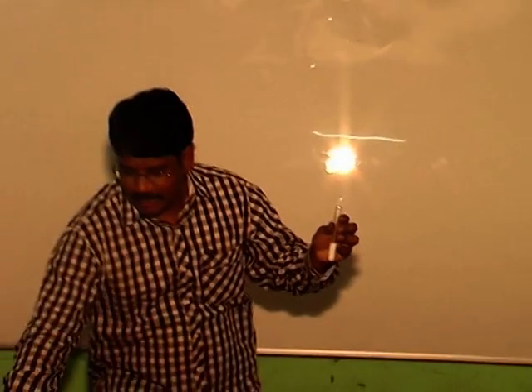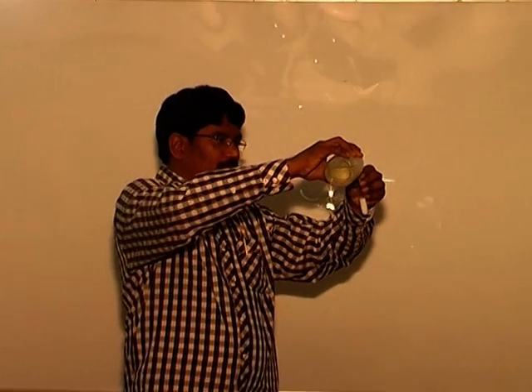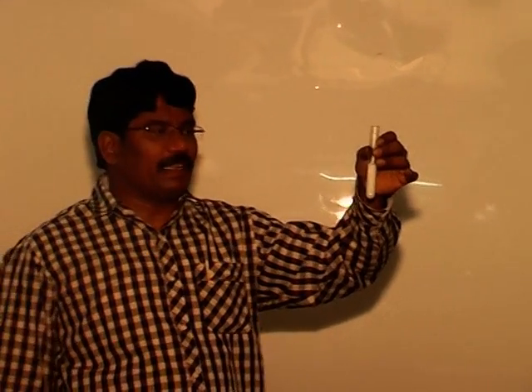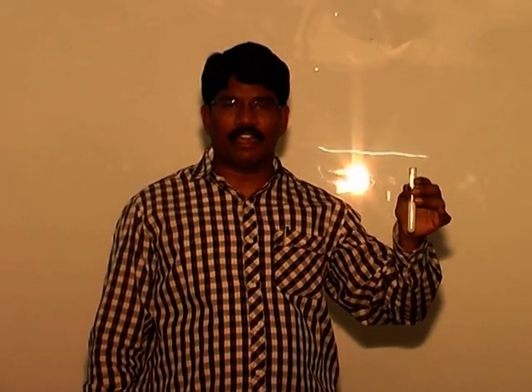For that, to the same precipitate I am adding concentrated HCl. Now the precipitate does not dissolve in concentrated HCl. If the precipitate is insoluble in concentrated HCl, then sulfate ion is confirmed. That means your anion part is completed. For anions 4 marks will be awarded, and for physical examination 2 marks will be awarded. So overall the 6 marks part of qualitative analysis is completed.